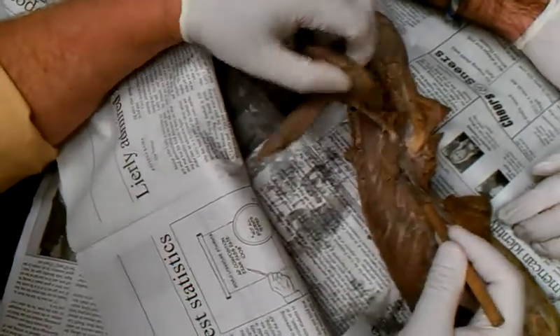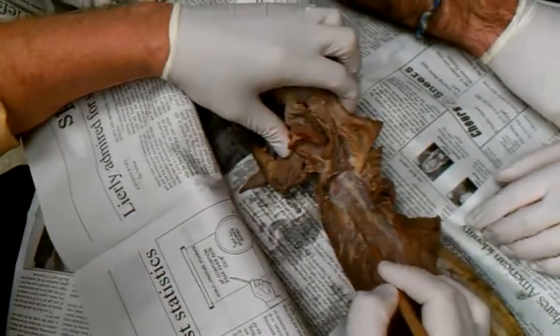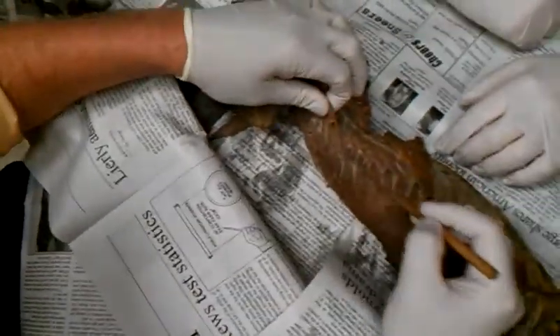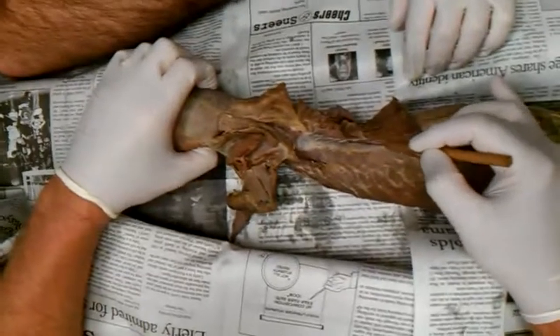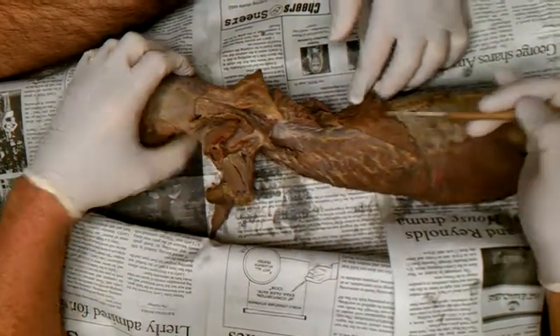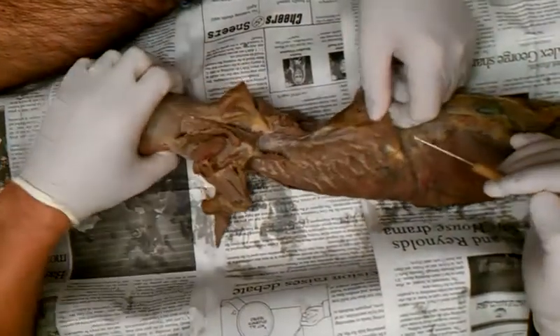This is the serratus ventralis and the serratus dorsalis is right behind it. There are three muscles that kind of parallel each other all the way up here. You'll want to cut right along the edge so it's completely out of the way and right up to the midline.